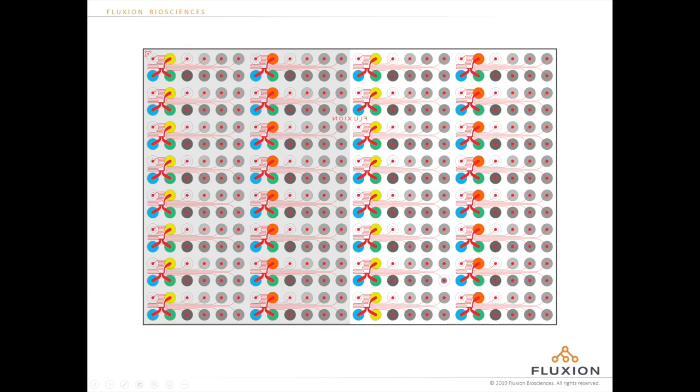So we used zone 1 and zone 2 for the long form and zone 3 and zone 4 for the short form. So basically we divided the zones here. So this is zone 1, zone 2, zone 3, and zone 4. And we divided the plate into 2. And we used these 2 zones for the long form and these 2 zones for the short form.